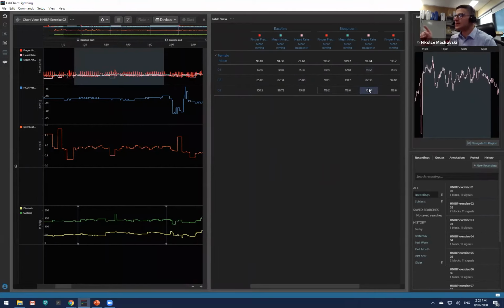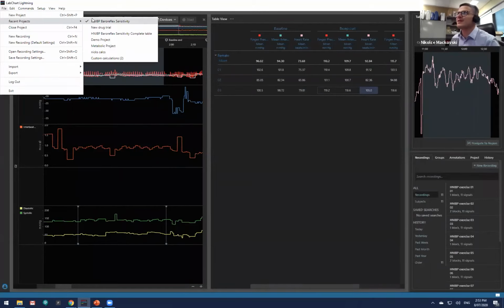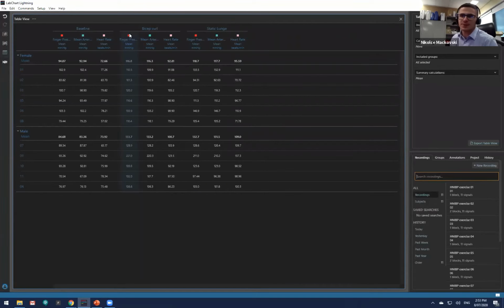So now what I'm going to do is finish these. I'm not going to do them all at the moment, as there are quite a few, but what I've done is I have finished this a little bit earlier on, and I'm going to go to the complete table version instead. So what we see now is the completed table. So with this table, now we see the female group. So this is when I was meaning that it's good to categorize what they are.